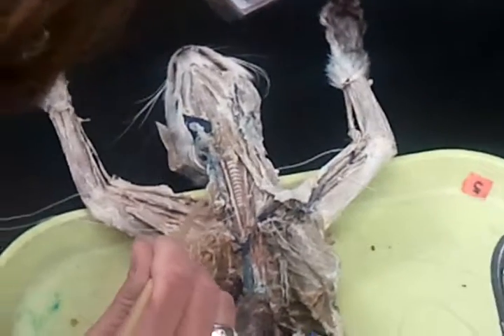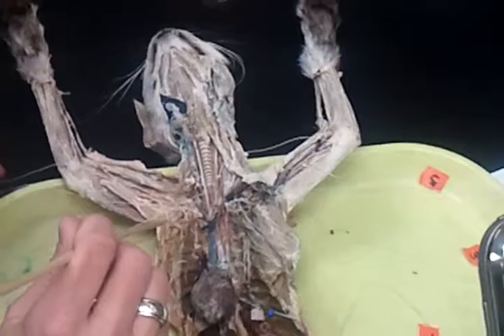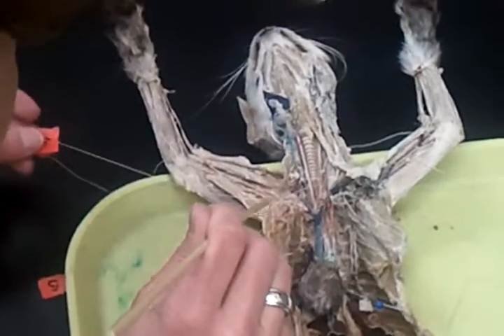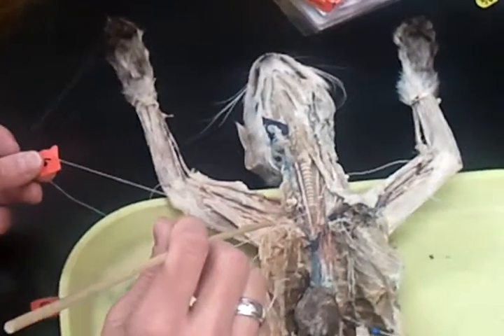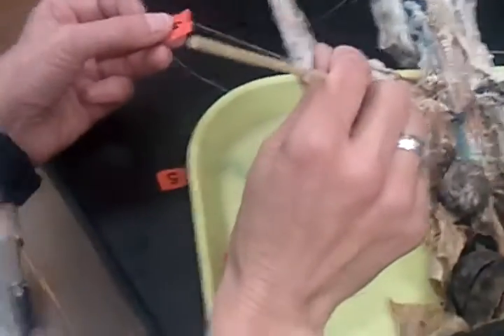The clavicle for the cat will be located approximately right here in the shoulder area. The right subclavian artery then comes into the armpit region for the cat. And I think this is the one that got torn away, right? Number 6. So in the armpit region, this one just got torn, but you have to imagine this connected with this. This is the armpit region. This is the axillary artery.